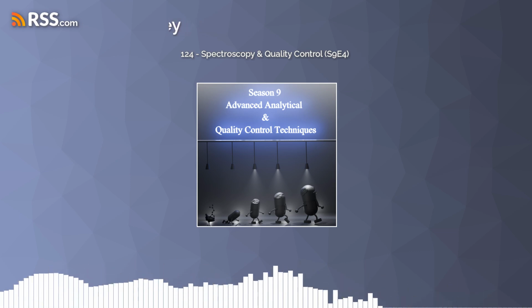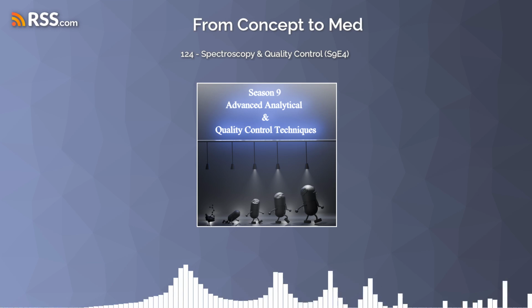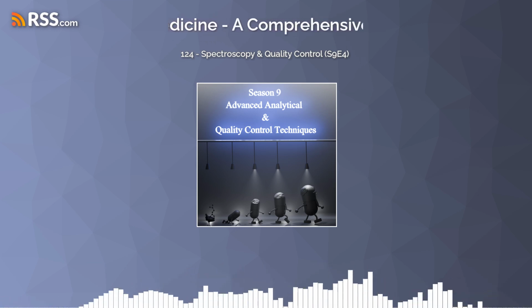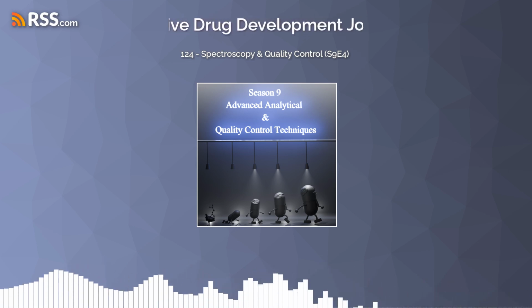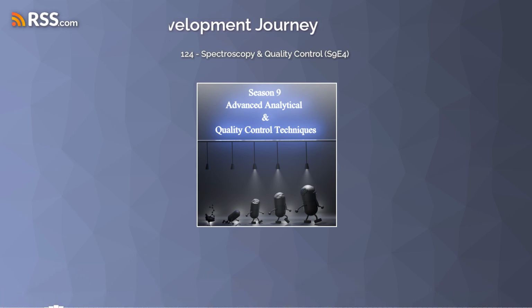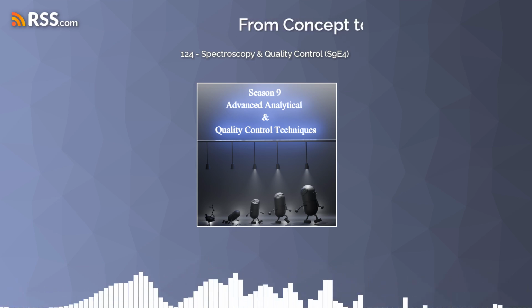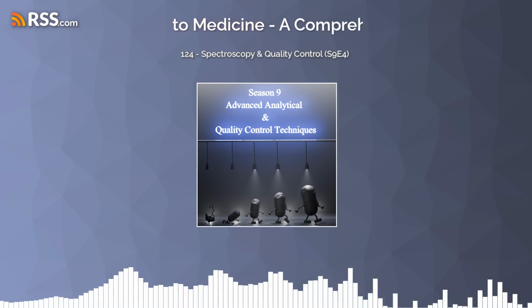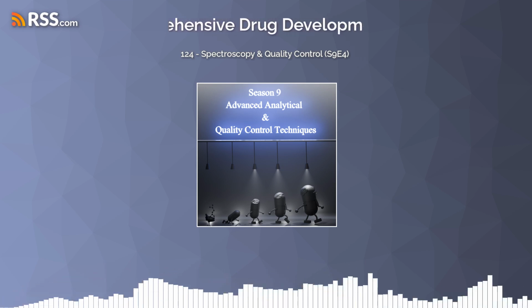Kind of similar to what we were talking about with IR. But it's a slightly different approach. So instead of looking at what light is absorbed, you're looking at how the light changes when it scatters off the molecule. Exactly. It's like shining a light on something and seeing how it wiggles the light back. Right. And those wiggles tell us something about the molecule's structure. So the light loses or gains a little bit of energy when it interacts with the molecule, and that's the basis of the technique. That's how we get the information.